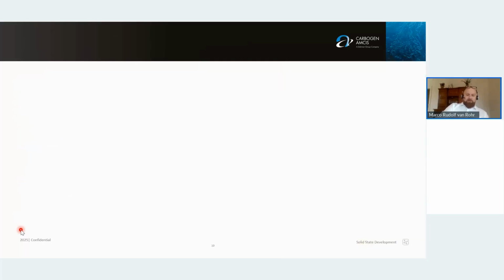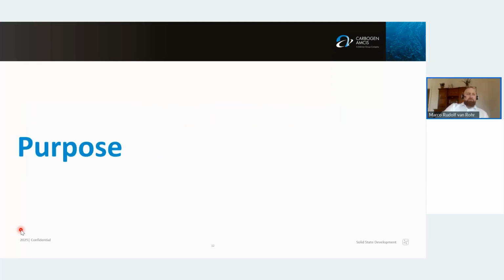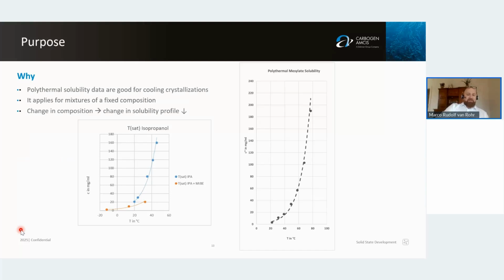So enough about CARBOGEN. Let's directly start with today's talk on isothermal solubility data. What is the purpose of translating this data?